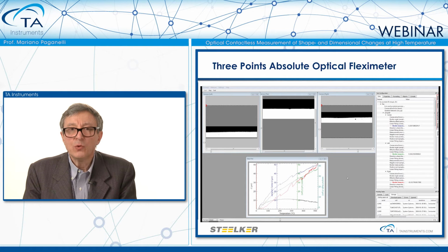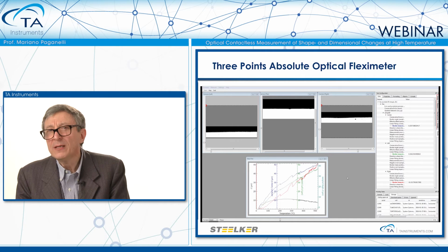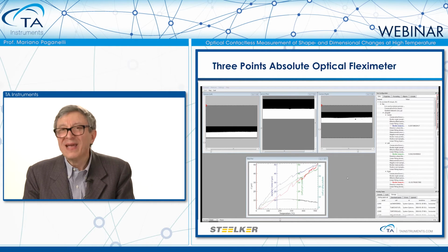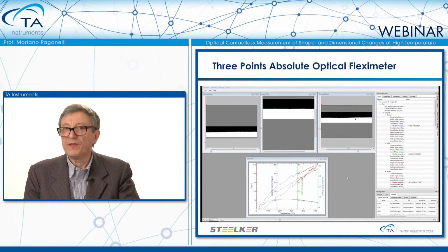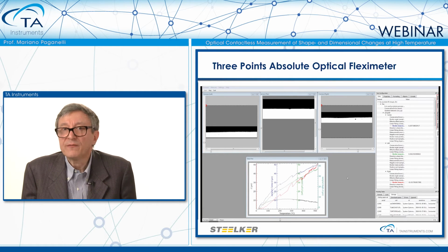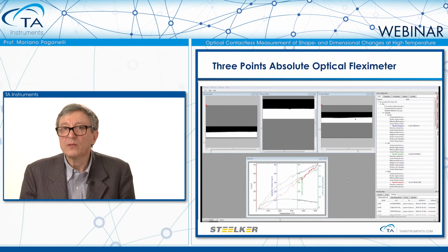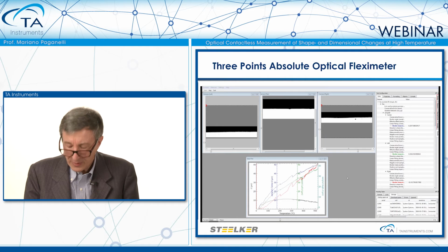This movie depicts a test run on an aluminum rod, which is not bending at all. Doing the math on the 3 points, we can see that the black line, which represents the drift of the measurement, is within 5 micron. So it's more than enough to say that with a 100 micron movement, we get a good accuracy.